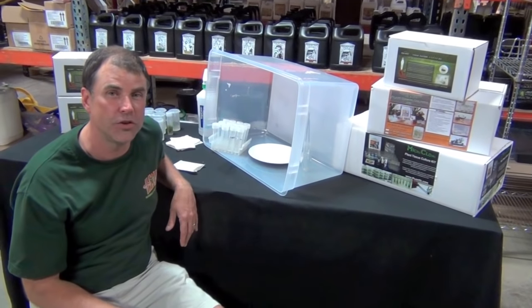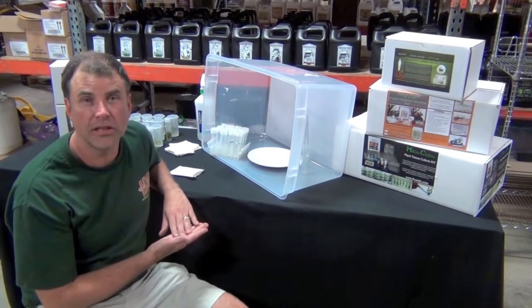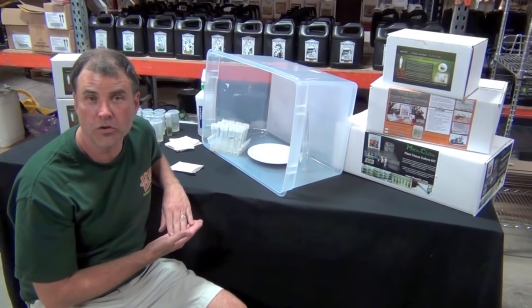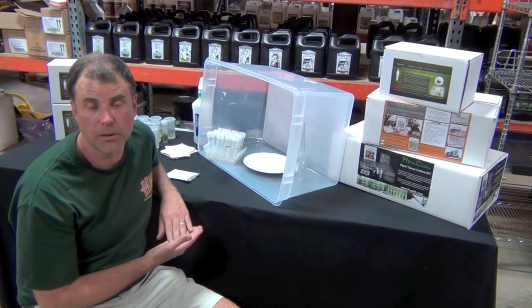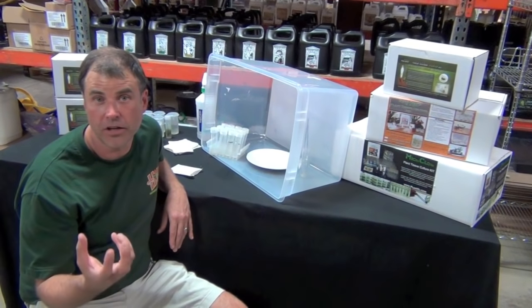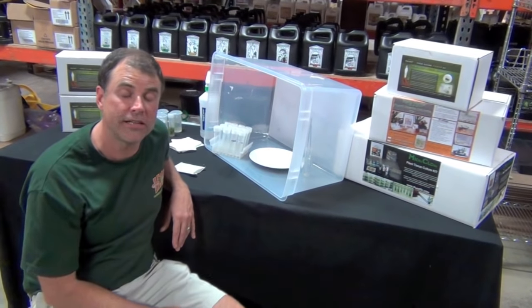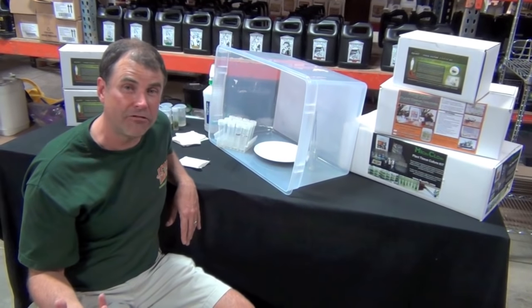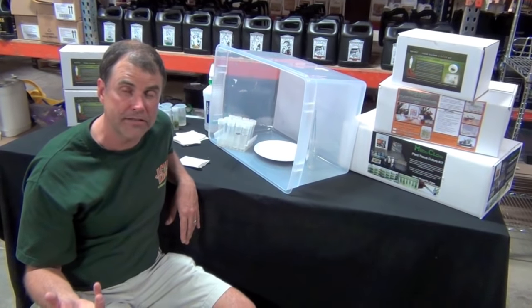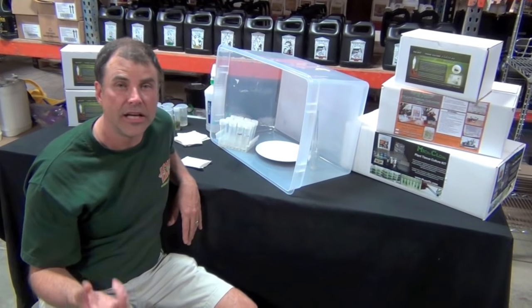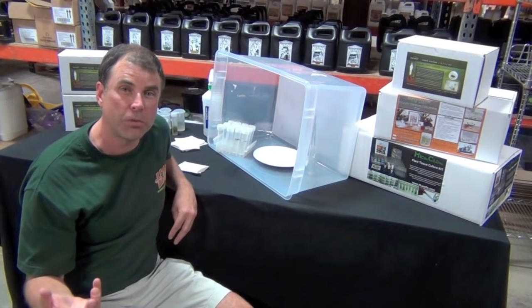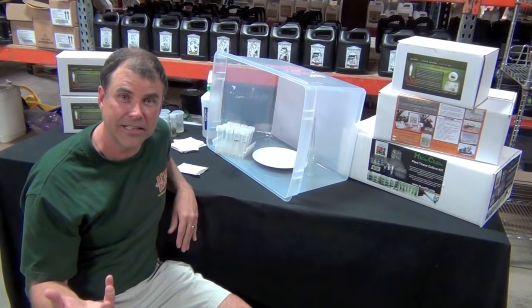The special part about tissue culture is that we're using elements like sugar to grow plants and we're surface sterilizing the plants so they don't have fungus on them. These are the two things we're concerned with when germinating old seeds. We also found that for plants with particularly valuable seeds like orchids, we can give them a head start using the exact same techniques.